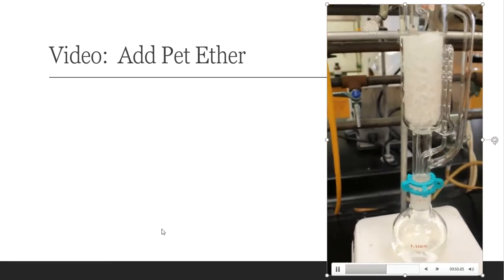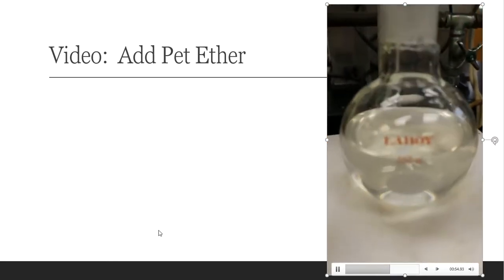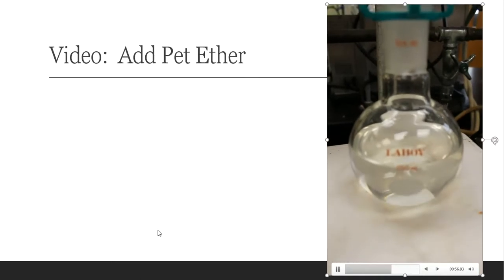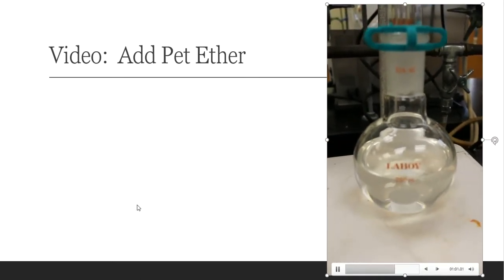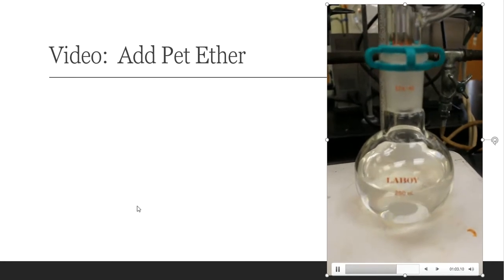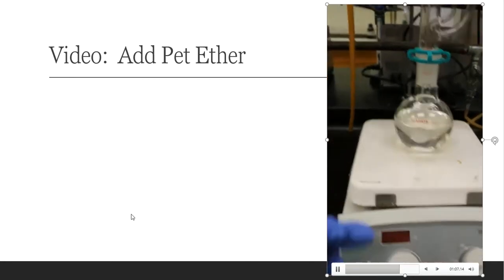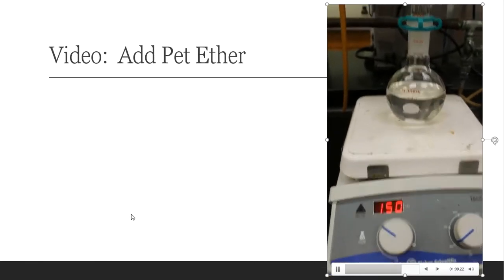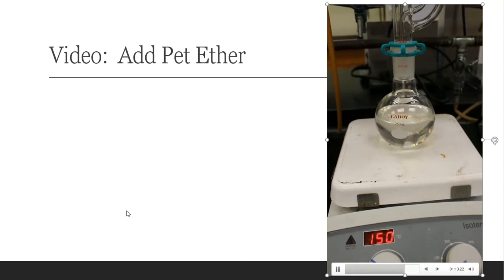All right, so I have filled this 250 ml boiling flask about halfway. I'm going to say at least 150 to 175 milliliters at this point, if not more. So this is where I'm going to start. I'm just going to turn on the heat. There we go. And I'll let this petroleum ether just start doing its thing.